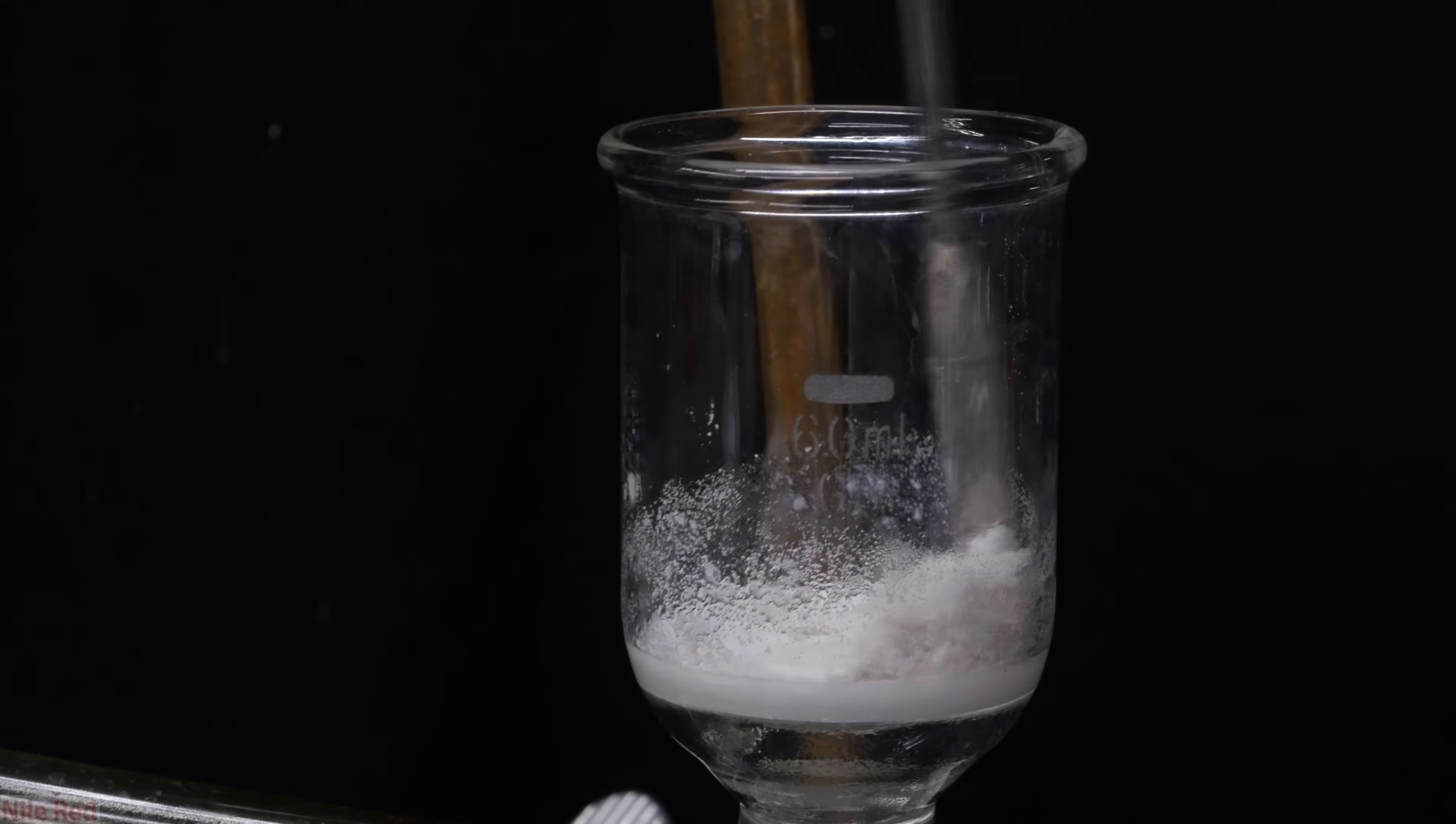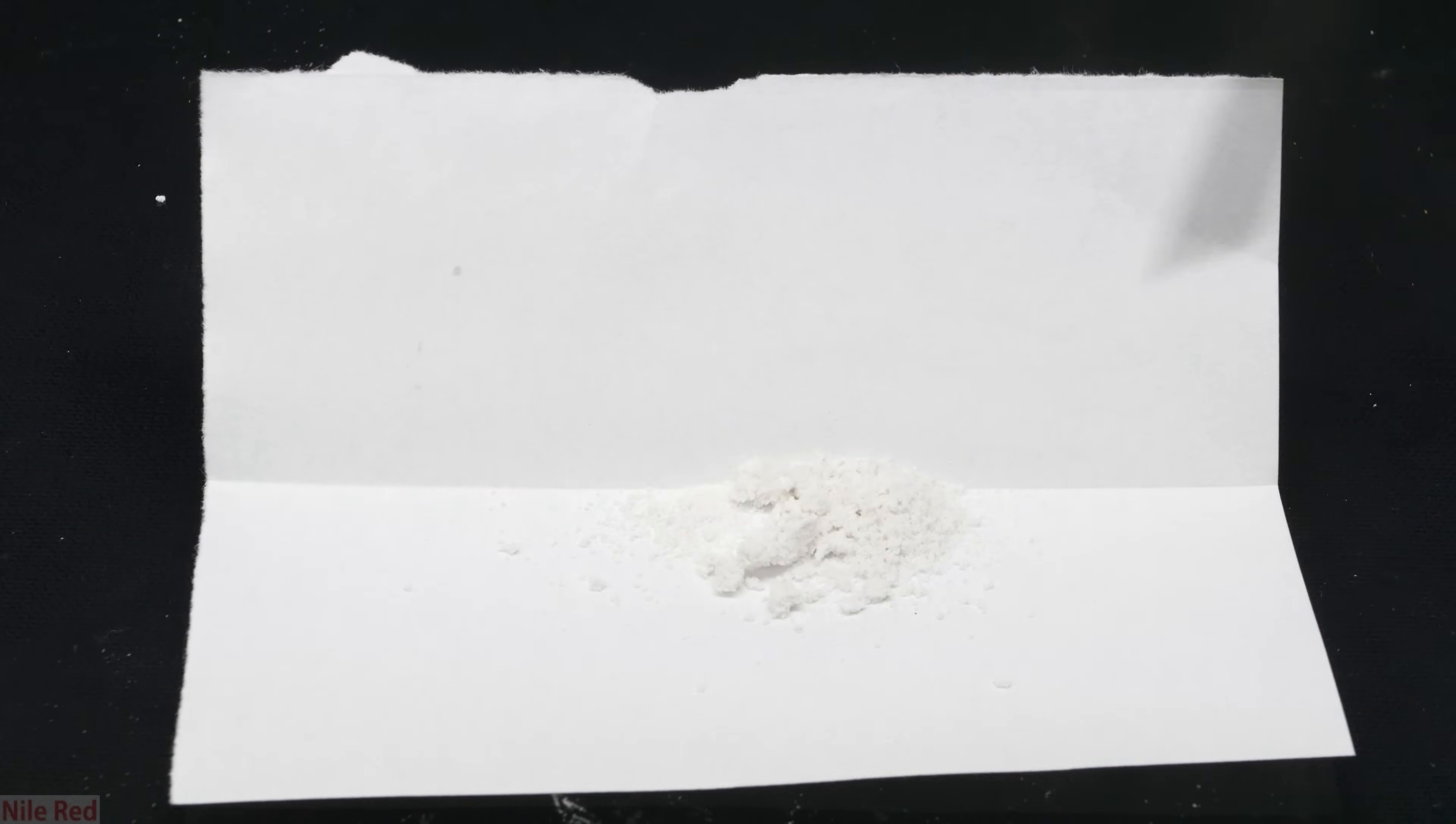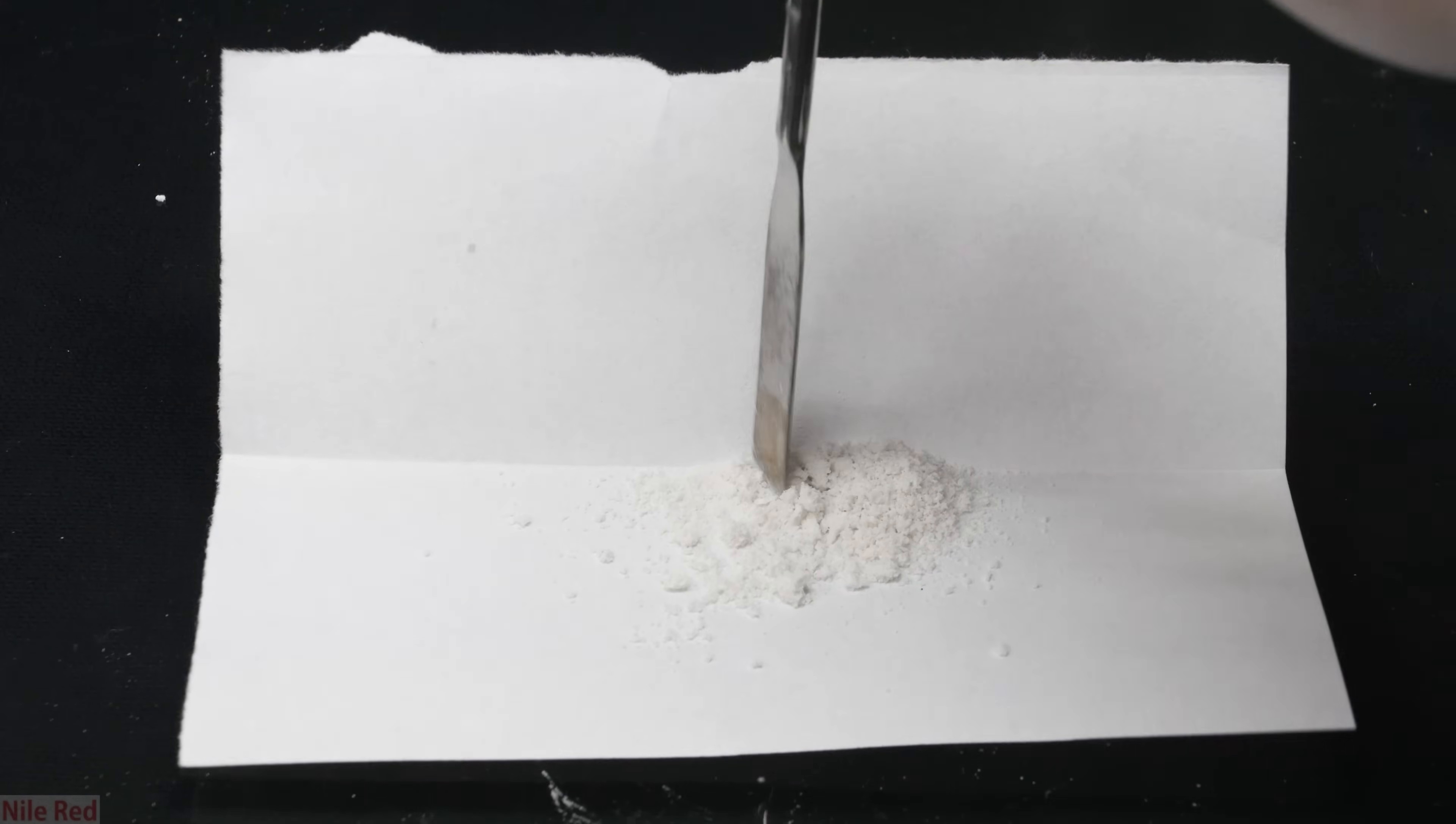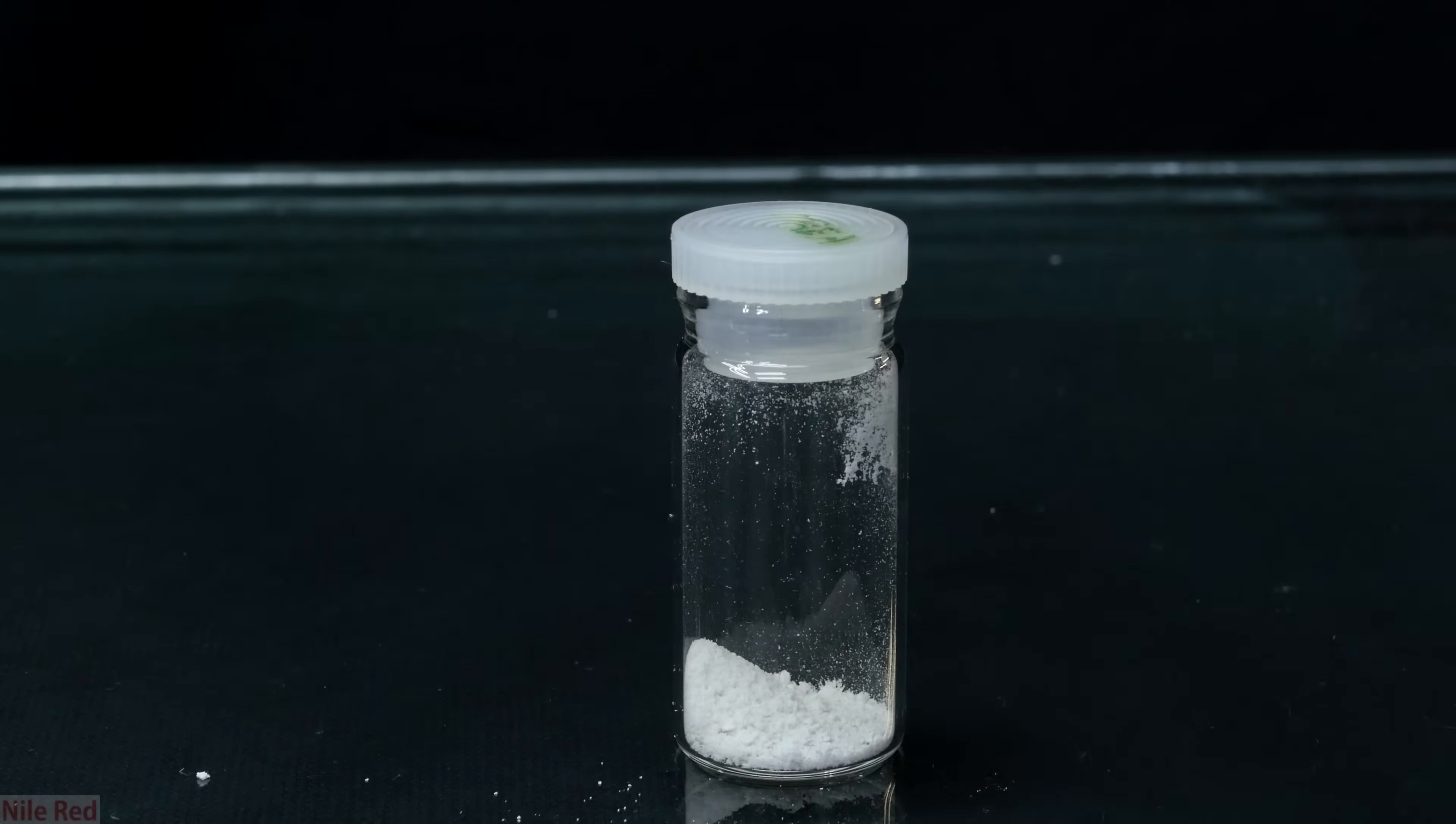Using a spatula, I scrape off as much as I can from the filter. I then transferred it to a small piece of paper to let it dry. Once it was dry, I used the spatula to crush it up and powderize it a little. I then transferred it to a dram vial, capped it, and labeled it accordingly as denatonium benzoate.